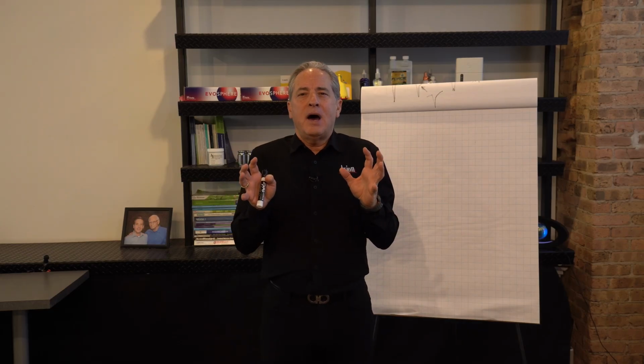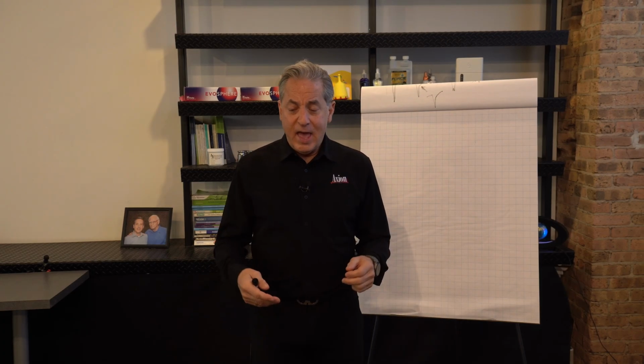Whoops, that's a problem. All of our HPLCs historically could not go to high enough pressures. So we've been limited by the pressure capability of the instrument. So let's say you have a bunch of what I would call standard HPLCs. I probably have 5 regular LCs and 5 UPLCs in the lab. I would define up to 6,000 PSI as a standard LC. You've got a standard LC, and you see the guys across the hall with their UPLCs buying these 1.8 micron particles. You can't do that because you don't have the pressure capabilities.